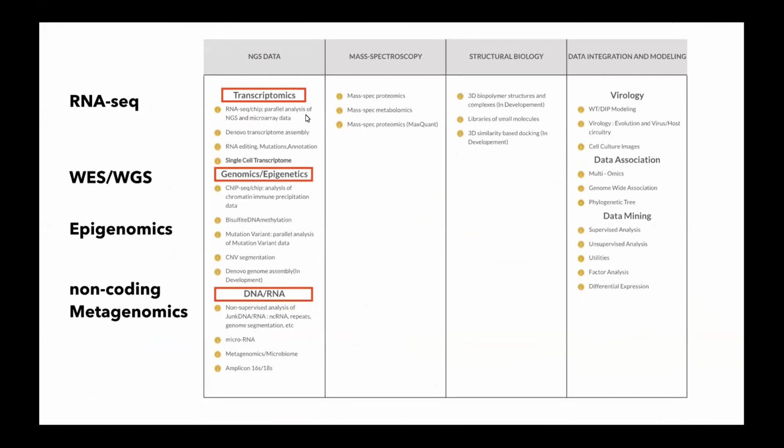So you can see that we have a whole section on next-generation sequencing data, and we'll try a couple of these sections to understand how the data gets converted from this raw FASTA format of short reads eventually to a structured table that we can actually use in downstream analysis, starting from exploratory data analysis, which is going to be the next topic that we will cover.